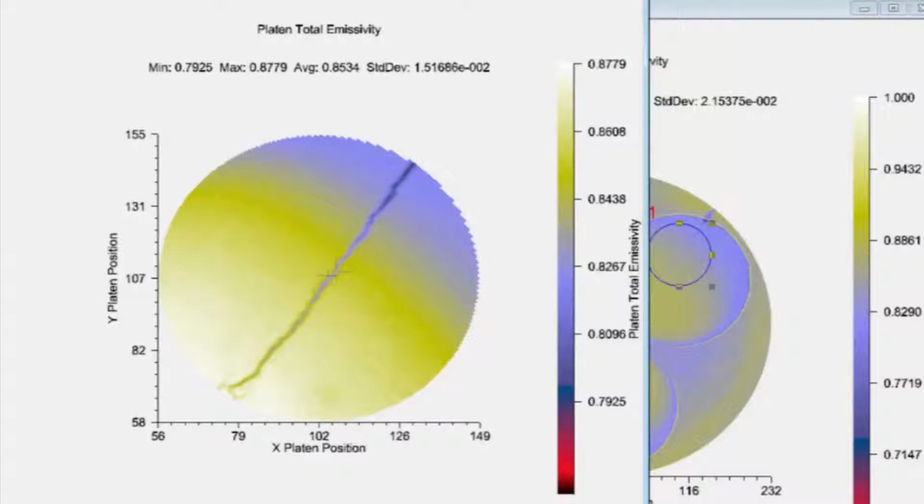This crack is not easily seen by eye, and typically these microcracks you cannot see by eye, but this obviously will lead to temperature non-uniformity. But maybe even more importantly, if you continue to use this carrier over time and heat cycle, it will actually explode either in your oven or in your emissivity deposition chamber, and obviously that's not a good result.